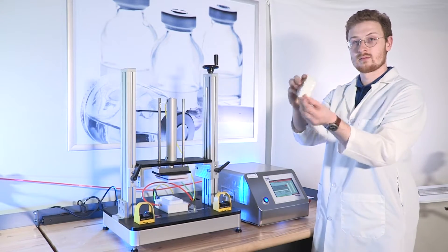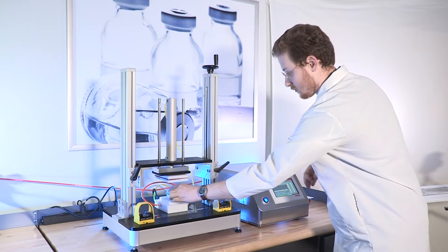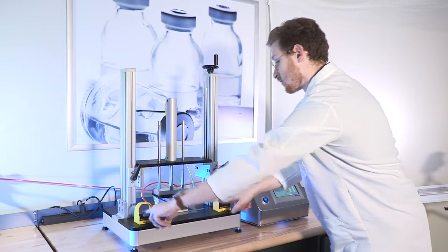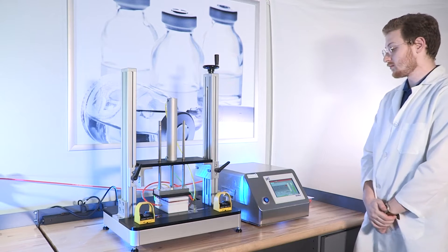Hi, my name is Andrew Kinney from PTI and today I'm going to be showing off our VariPak 355 Vacuum Decay Leak Tester for Tyvek tray applications.